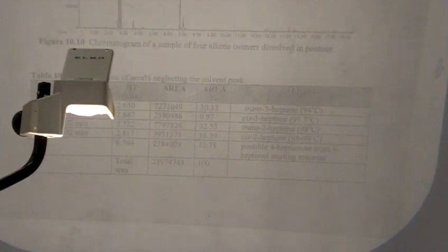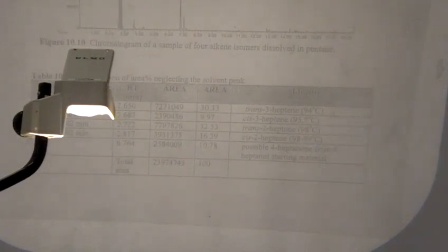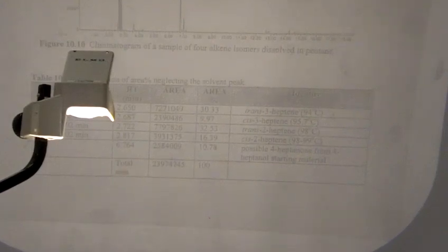So one way to figure out if that's a ketone or not, besides seeing a peak that looks like maybe your alcohol but doesn't have quite the right retention time, is that you should see it in your alcohol GC and your alkene GC. It's not going to go away between the two of them, okay? So between the two GCs, you should see the alcohol go away and the alkene be formed, but that ketone peak won't disappear. There's nothing you do in experiment 11 that makes that ketone disappear, okay?